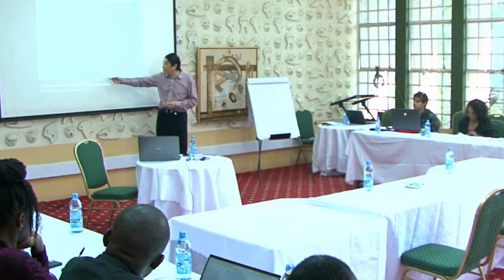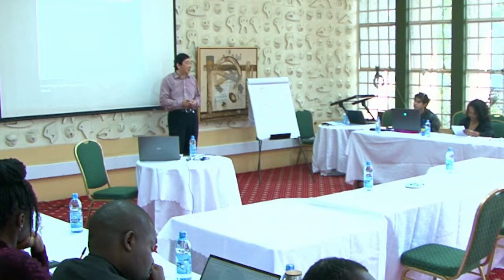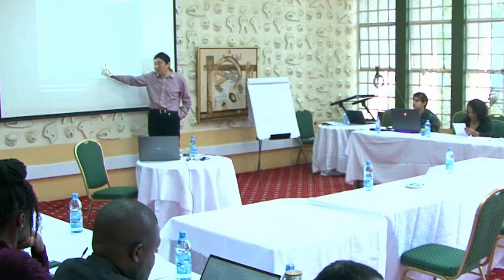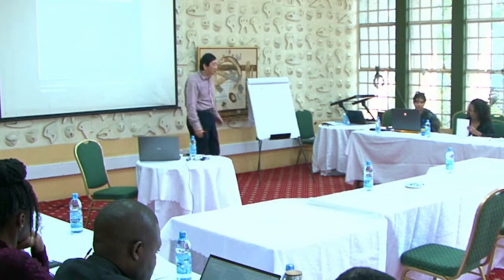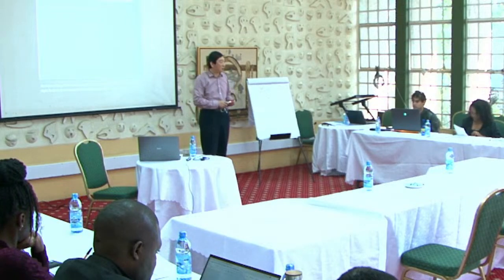And here, also do not forget the molecular ion M, 73, which indicates just one nitrogen, right? So these two combined tell you clearly your M is correct, your one nitrogen is correct, they verify each other, right?